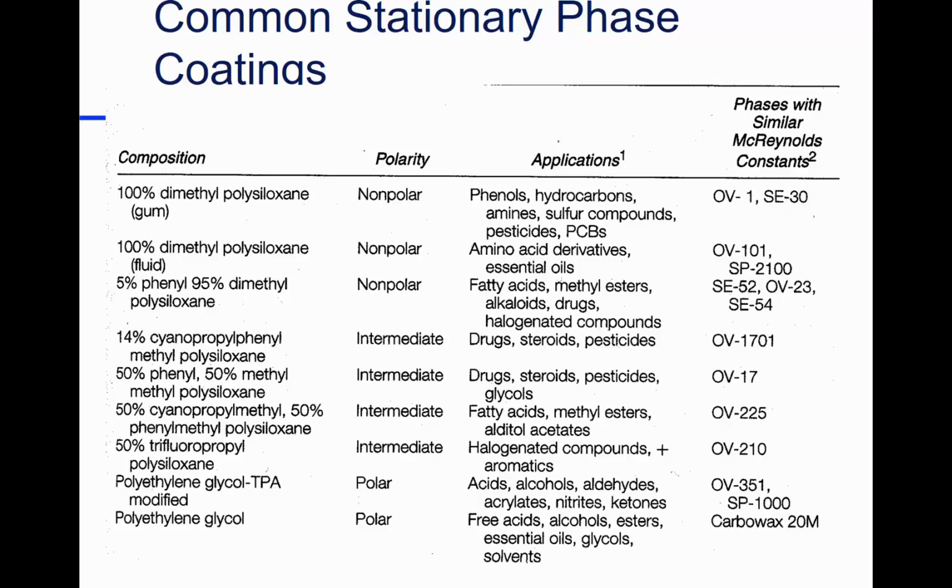The main reason for this is that when we didn't have very good, thin, high quality columns, we had to do a lot of separation by this coating. But once our columns became so efficient, we can say, well, gosh, this will do much more than it used to. And so these 9 really do what 300 used to do, which is a real advantage.